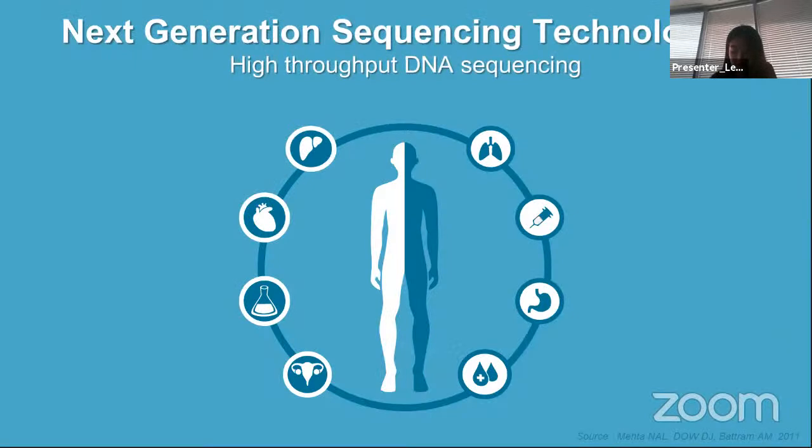Next generation sequencing analysis is a fast method of sequencing genomes, also called high throughput sequencing or second generation sequencing. DNA sequencing is a technique that analyzes the sequence of bases that make up the DNA chain in the cells of life in a biochemical way. Sequencing technology has evolved over the past 15 years, and new methods are continually being commercialized. As the technology develops, the number of corresponding applications for basic and applied science increases.